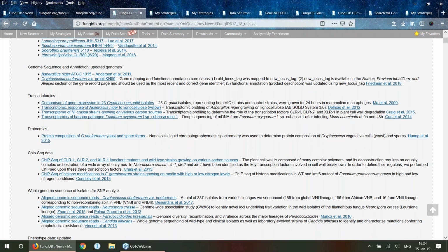All right, thanks, Mark. All right, the next dataset that I would like to walk you through is the proteomics dataset that we have loaded for Cryptococcus neoformans JEC21. For those that are not fungal specialists, before I demonstrate the search, I'll briefly mention the specifics of this dataset. Notice that the authors have looked at vegetative cells, yeast, and also spores, and essentially looked at the proteomic fractions from 3 different replicates for each sample.